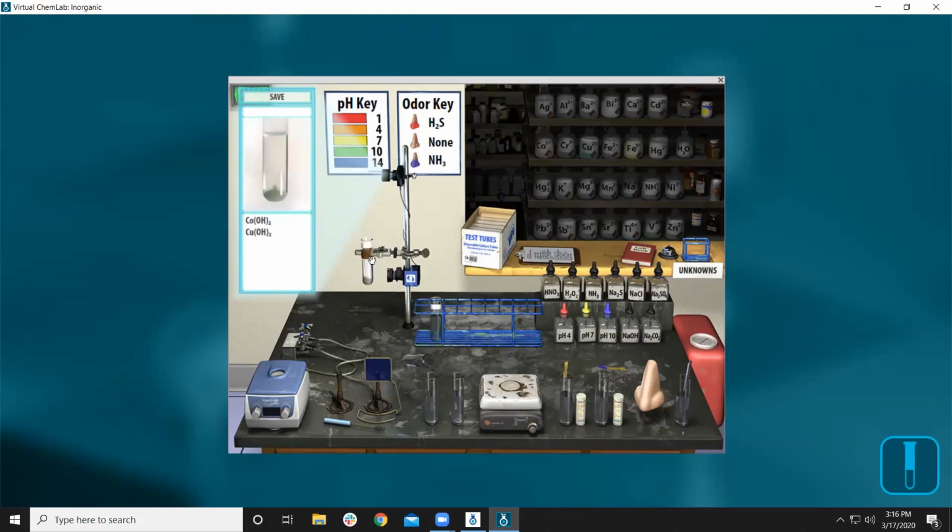And then we can do some chemistry here. So here's ammonia. So I've added ammonia, centrifuge that. So my copper is in solution, my cobalt isn't, but if I go to pH 10, they both are. If I go back to NaOH, then I get the one in solution.